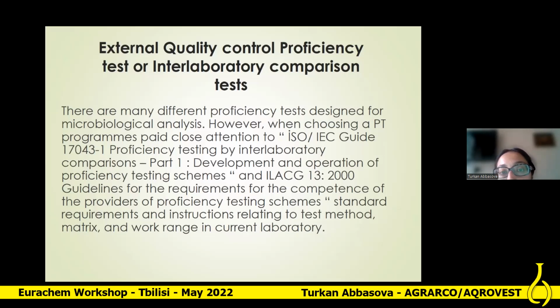And I think, it's my own opinion, every laboratory has to participate in proficiency test processing, because it is the evidence and the ensuring of the competence of the laboratory, and this is a requirement of the accreditation body. The results of the proficiency test, besides the internal control, such as validation and verification processing, also demonstrate the reliability and ensure the testing.